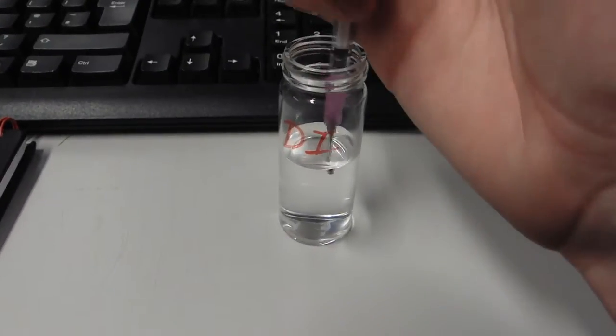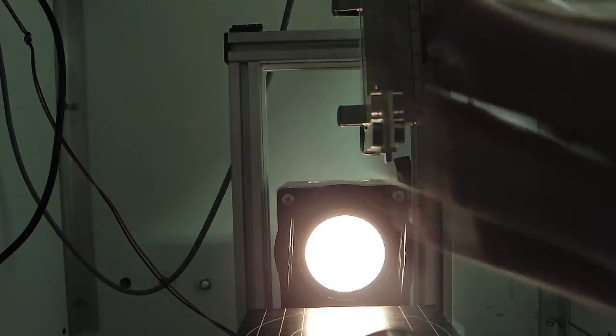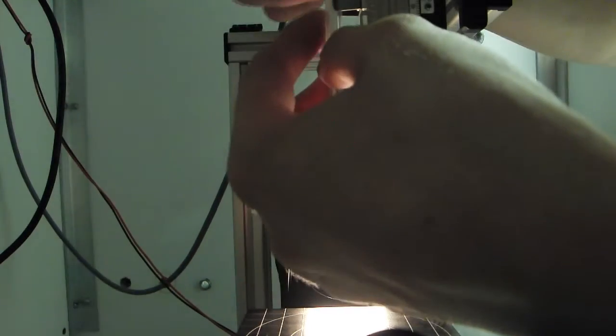Next we draw up a syringe of the fluid in question. Here we're using deionised water. The syringe is then inserted into the holder.